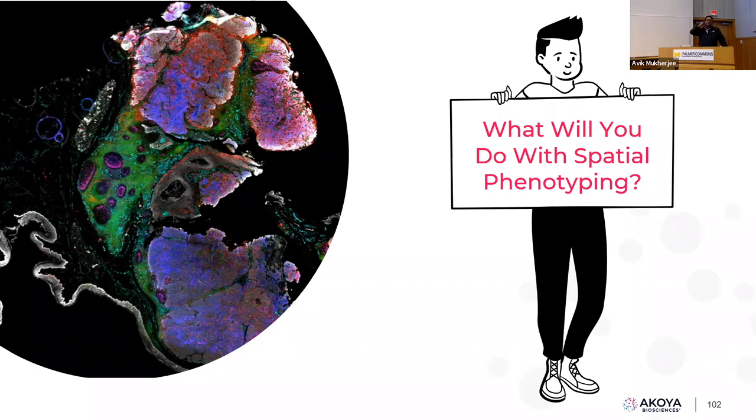I think the limiting factor for us is we are a proteomic company, we come from the protein approach. So that's why we are not starting with a huge panel initially. We are starting with one that you can do in a measurable amount of time so that you don't have to wait for weeks for thousands of things. We have seen that a lot of our early adopters, once they have done some orthogonal technologies, can do the visualization with this many markers, say 50 proteins, 50 RNA, and they get a revealing result.